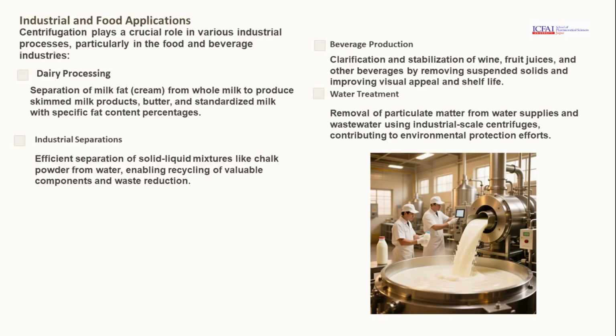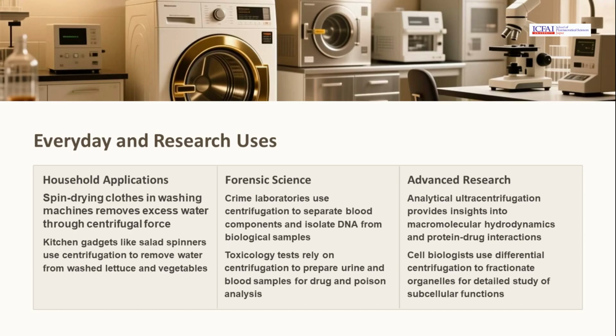Centrifugation plays a crucial role in various industrial processes, particularly in the food and beverage industries. It aids in dairy processing, beverage production, and water treatment by separating components efficiently, improving product quality, and ensuring environmental protection through waste reduction. Centrifugation finds applications in everyday life and research.